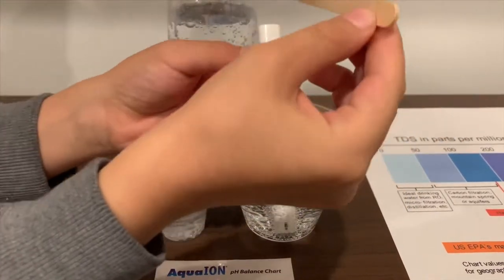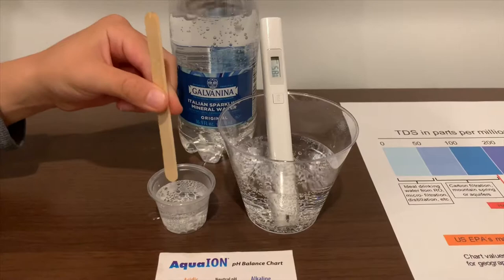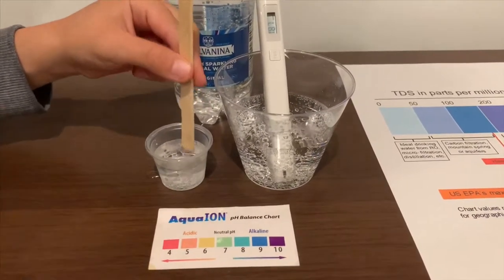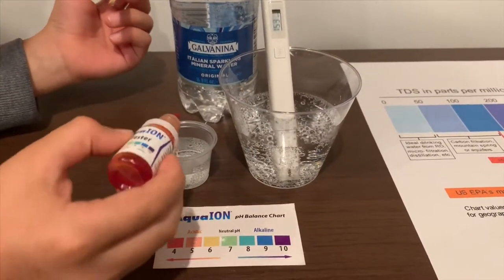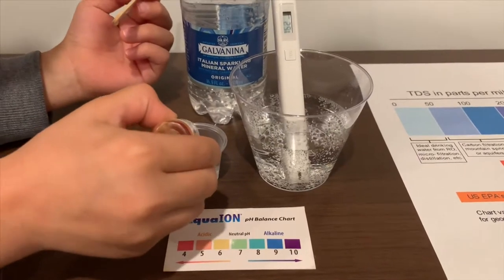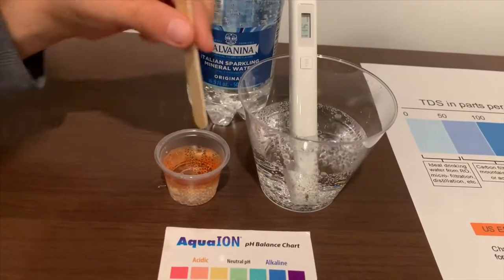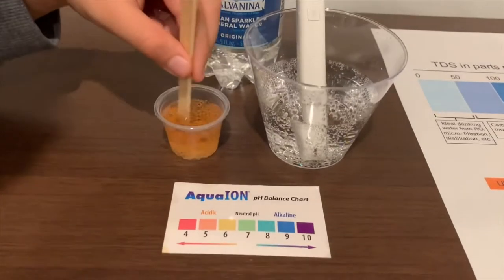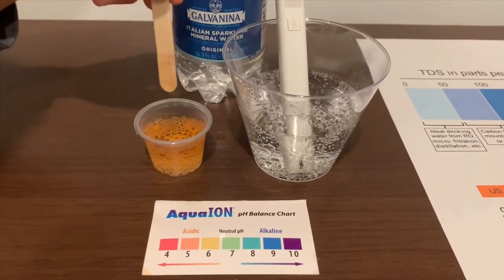Let's stir the pH up too, so we'll get a better result on the pH. If you want to buy this pH tester, the link's down below. I'm going to do two drops. I'm going to give this a 5.5 — this is acidic.